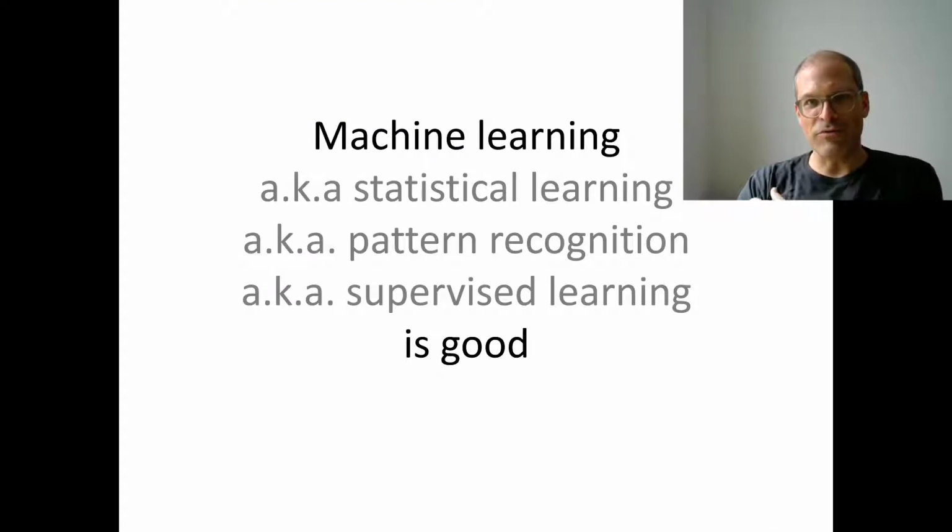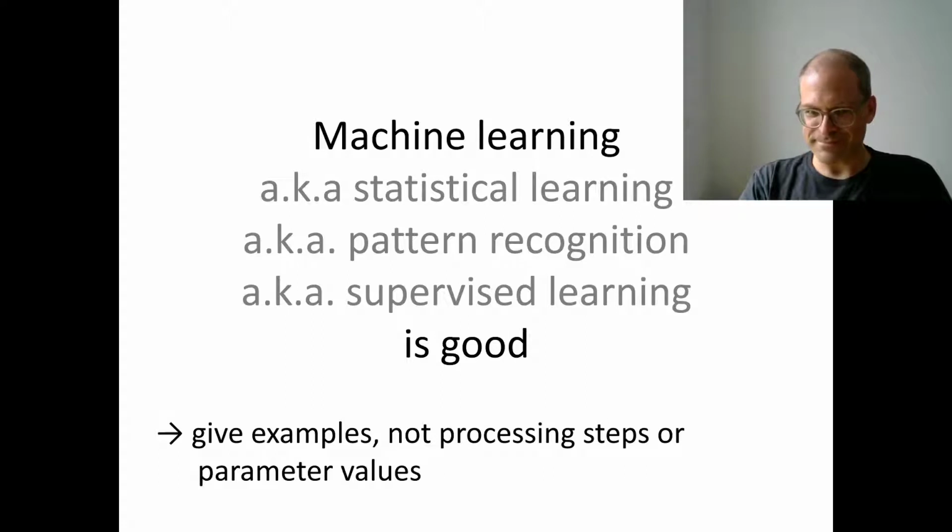A slide I gave to the bioimage analysis crowd a few years back, and I've been preaching the gospel that machine learning is good. This was slightly before it became a great fashion. By now it doesn't need much preaching anymore. Everyone is convinced that this is a very useful tool in bioimage analysis and beyond.